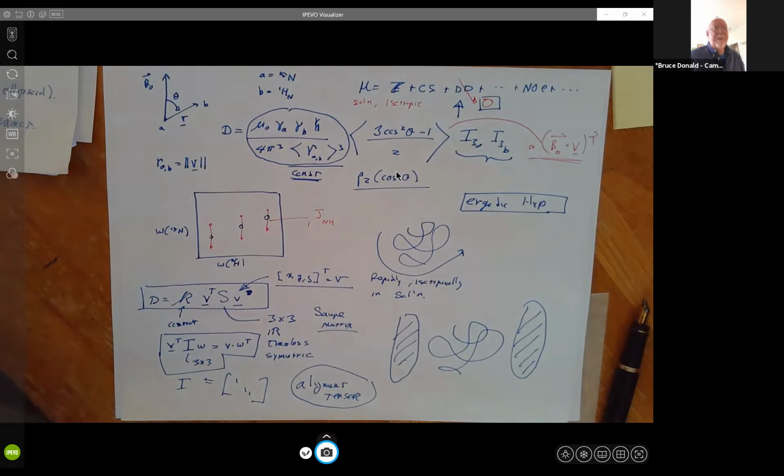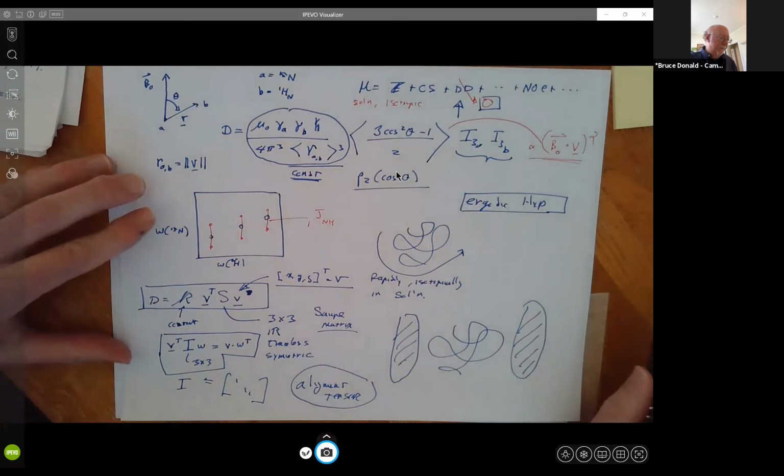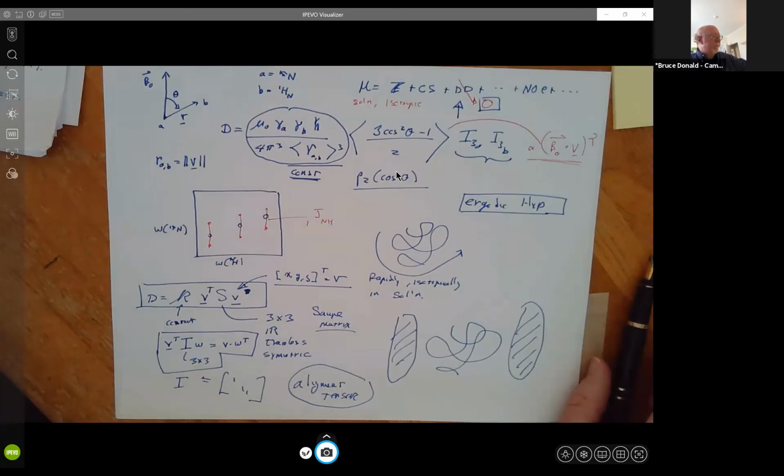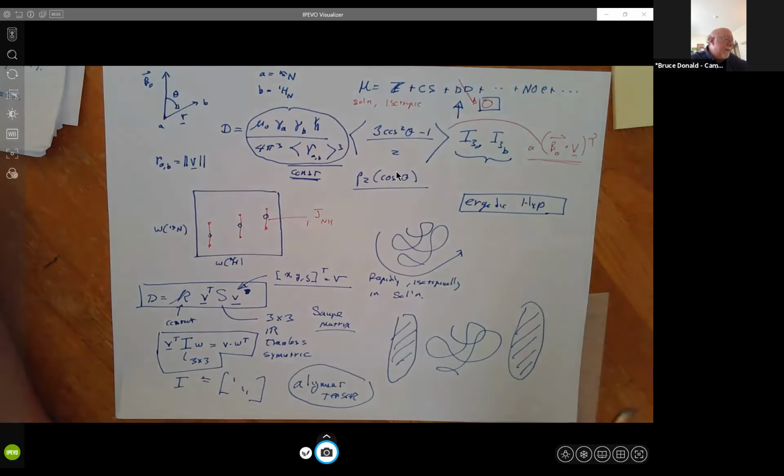This is complicated stuff, so I definitely want to get this correct. All right. So this is an intimidating object, and I want to give some intuition. What's our question? Sorry to interrupt. Can I ask a quick clarification question about the scalar? Are you saying that when you're averaging over all of the rapidly tumbling proteins in an isotropic material, you're going to see the decoupled signal, because you average to the middle?